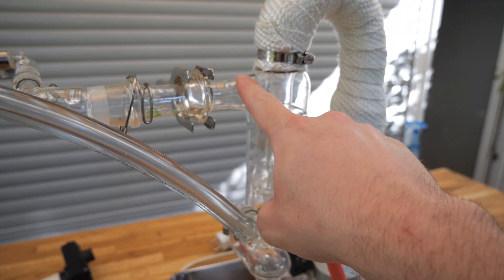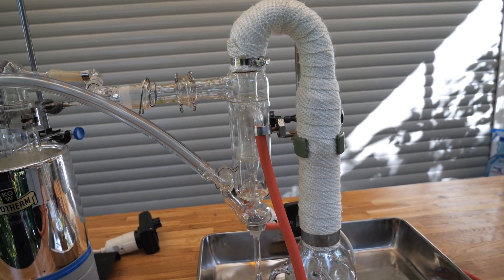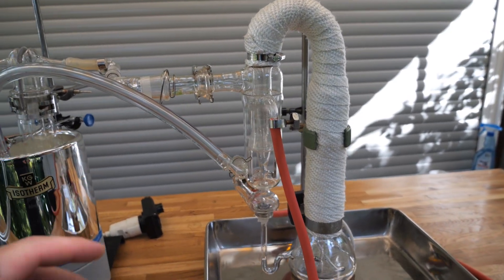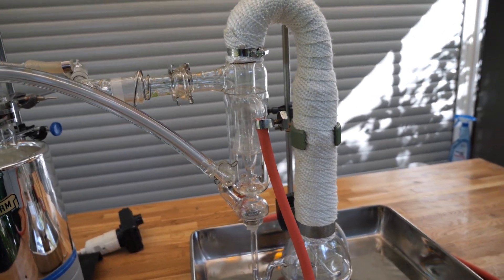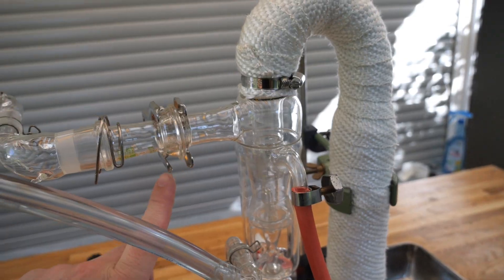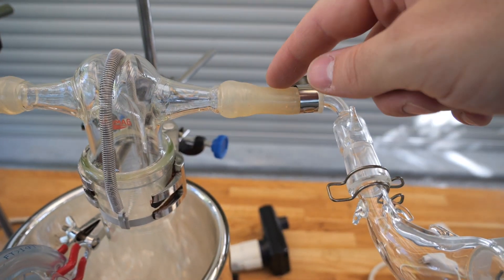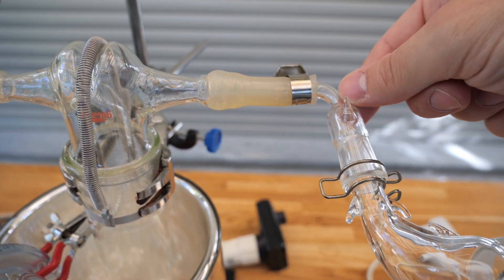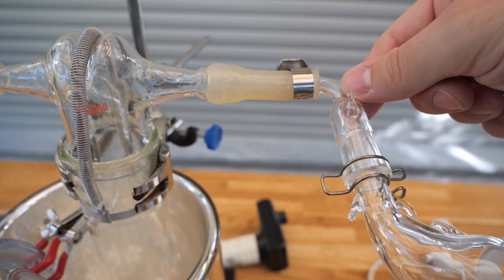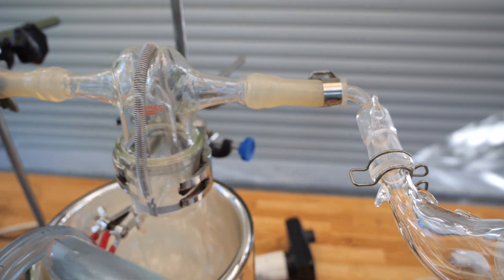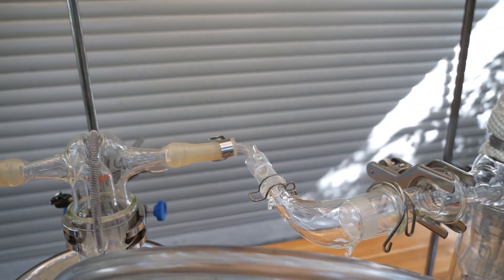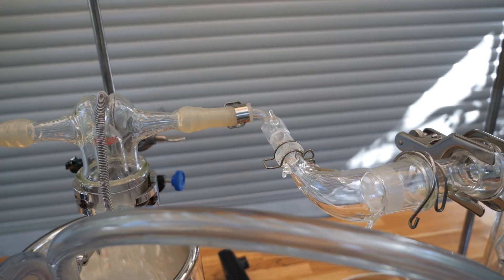The large port is the high vacuum port. Basically if you're looking for the high vacuum port on a system like this or something similar, it's most likely the larger opening. This is connected also to a cold trap. As you can see the cold trap is connected via a hose and also via a pretty small diameter connector here which is basically nonsense. Small diameter tubing and also rubber ruins your high vacuum.